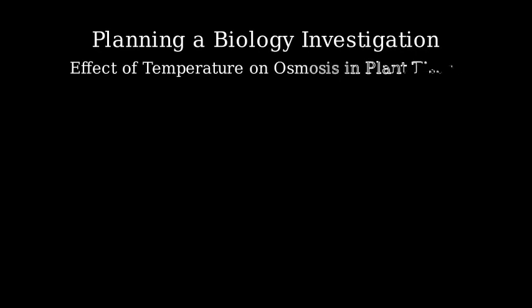Welcome to this biology investigation planning video. Today, we'll learn how to plan an experiment to investigate the effect of temperature on osmosis in plant tissue. This is a common biology practical that tests your understanding of experimental design and osmosis concepts.